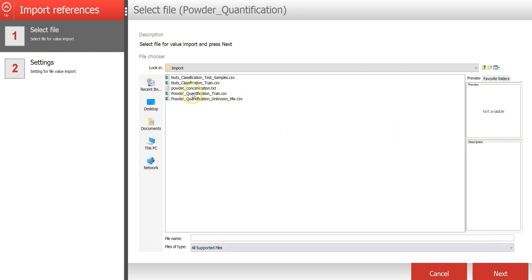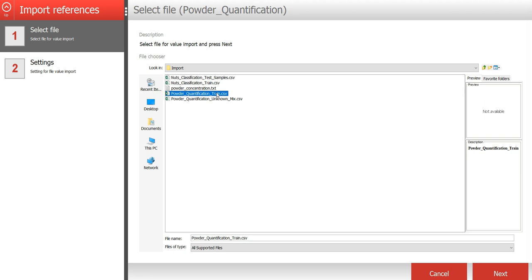I will select this CSV file called powder quantification train that contains the reference values that we're going to use to develop this model.